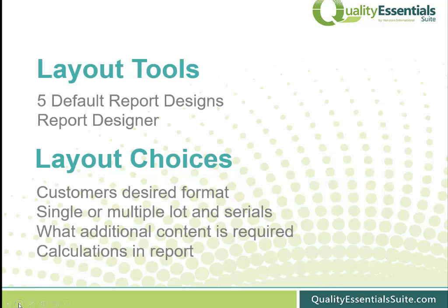When considering the development of layouts, the user will be able to give consideration to such factors as: what is the format of the report the customer has requested? Will the report contain data from multiple or single serial and lot controlled items? Is there additional content, such as boilerplate text or signatures required on the document? And finally, will the results provided on the report require additional calculation events during report generation?